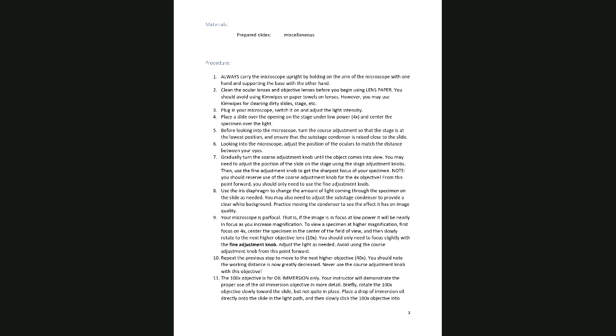And you should never, under any circumstances, sit there and crank and crank and crank the fine focus. That's not how that works. If you were in focus on the lens before, you should only need to make a fine adjustment to bring it into focus on the high dry and then next on the oil. So fine focus, you shouldn't have to turn that knob very much at all.